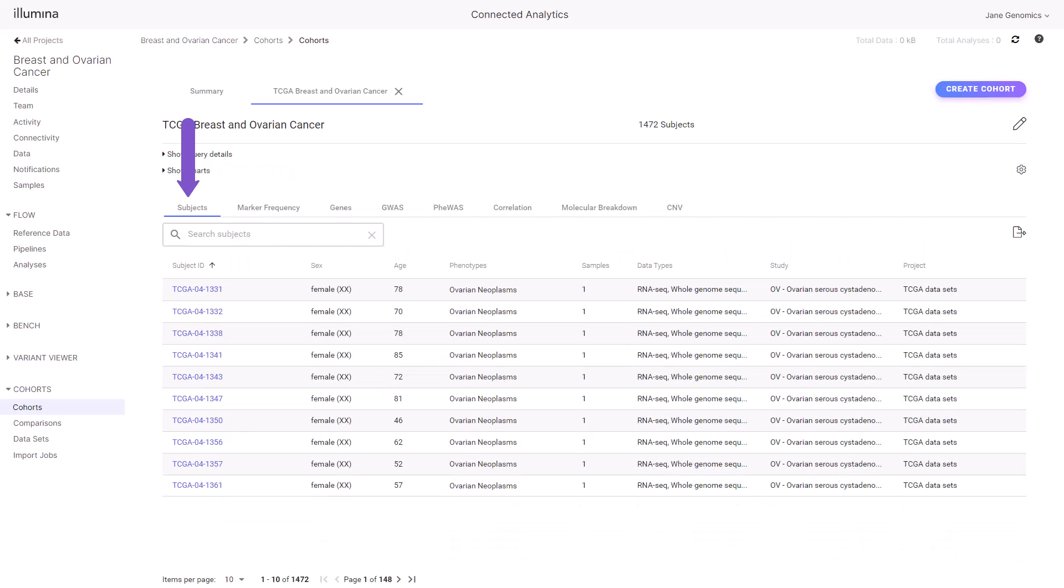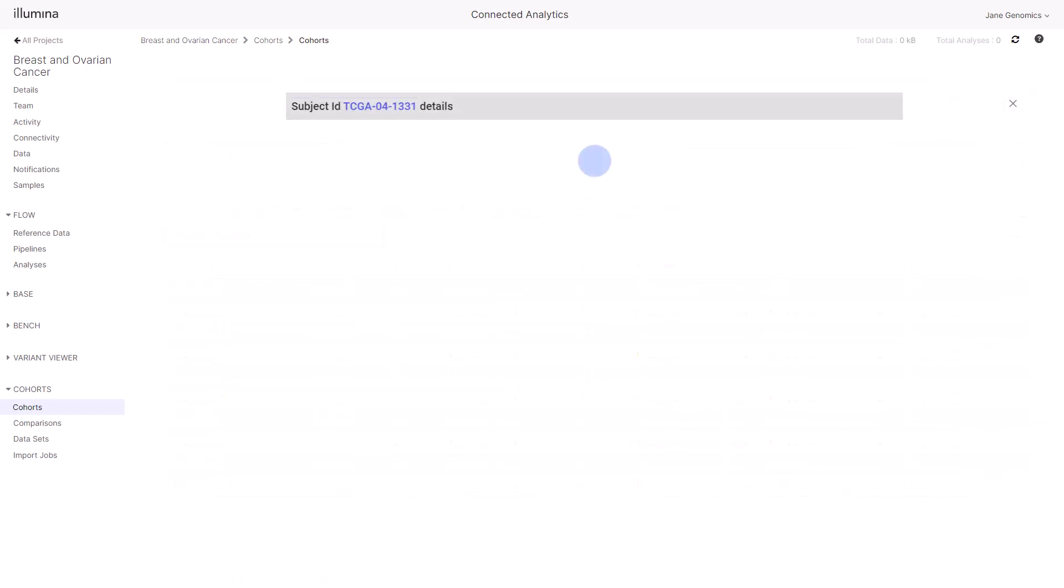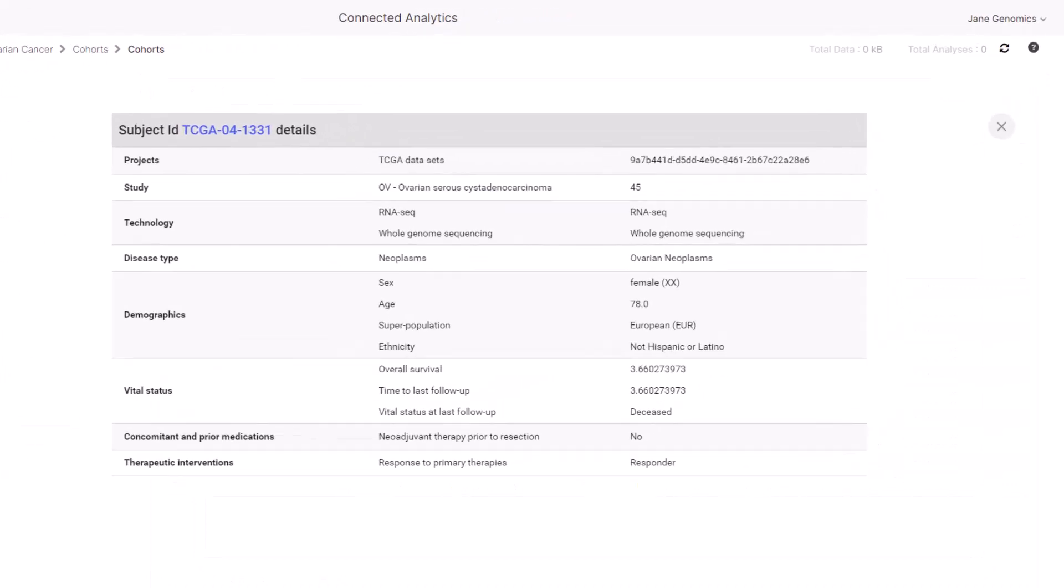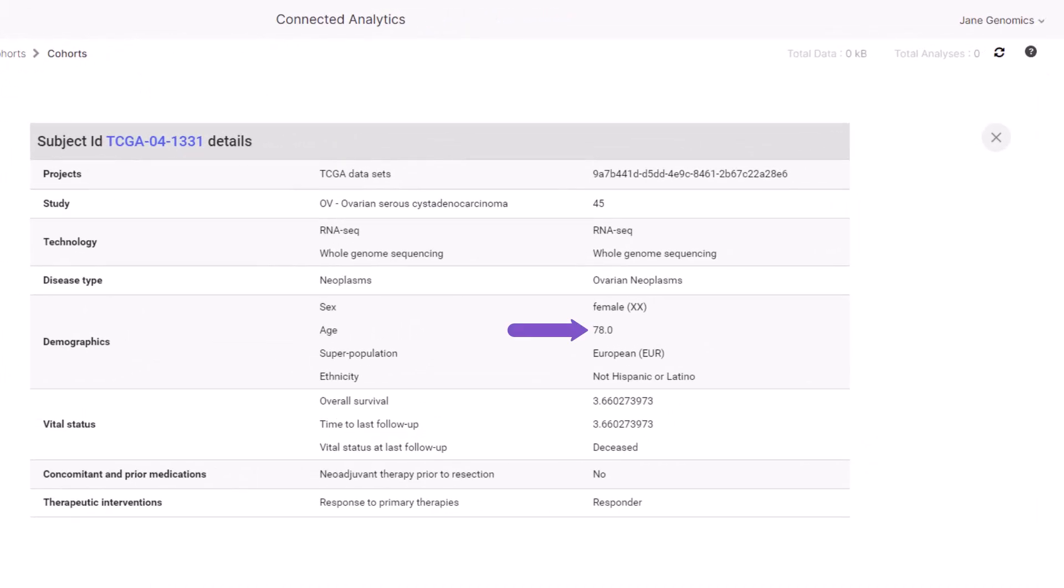Displayed is the subject ID and other high-level information, like data types measured and reported. Select a subject ID to view the data collected at the subject level. The subject is a 78-year-old female with vital status and other clinical attributes that feed up into the subject attribute selection criteria when creating or editing cohorts. Close the subject's details.